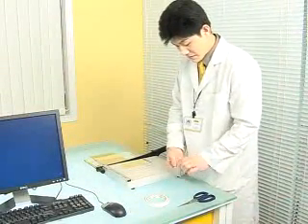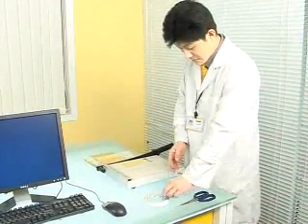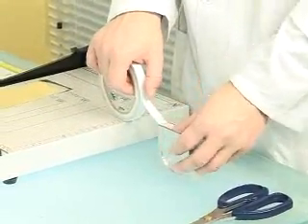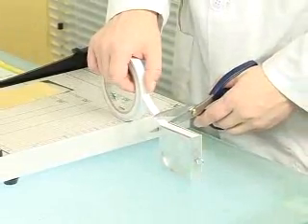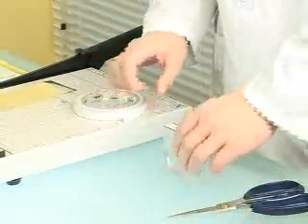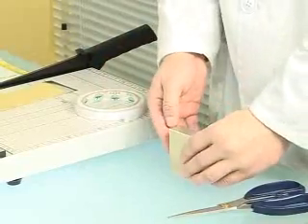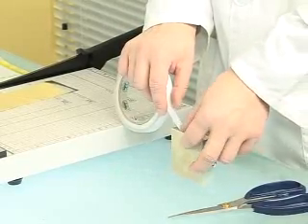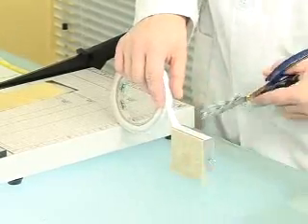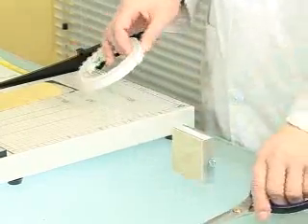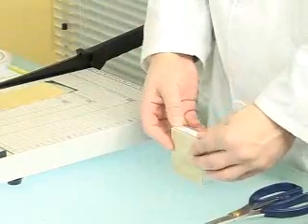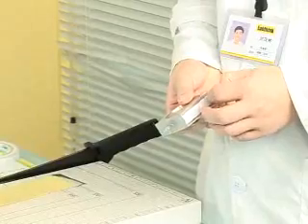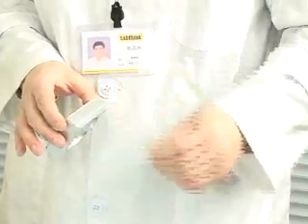Prepare and clamp the specimen, then put them on the stage. Place the specimen onto the test surface.